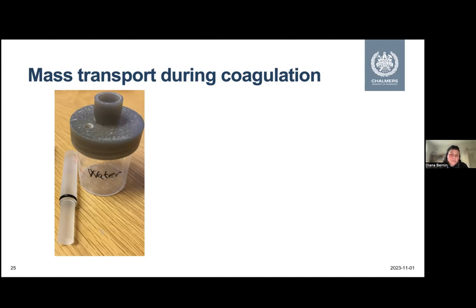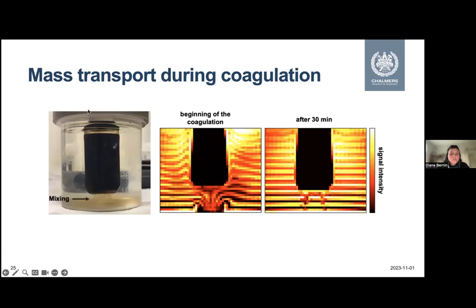we believe that the mass transport, because the solvent has to go out and the anti-solvent has to go in, might impact the crystallinity of cellulose. Also, if there will be inclusions, because it depends on how fast things are, and so on. So we try to measure this, but it's a multi-phase system. So imagine you have two liquids which are both transparent mixing. And to show you how it looks, here we have a movie.